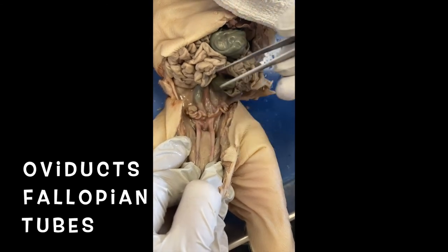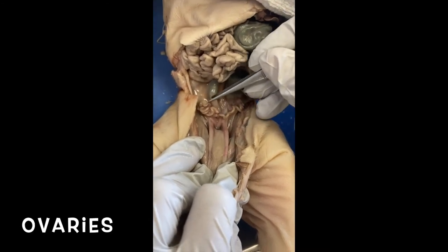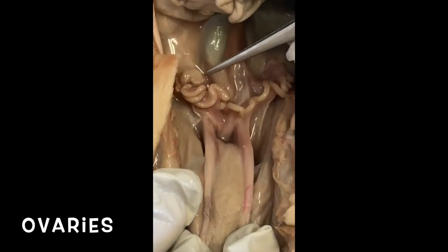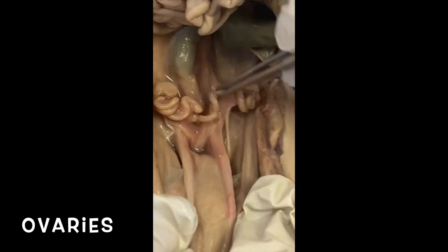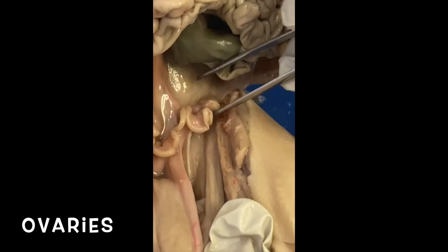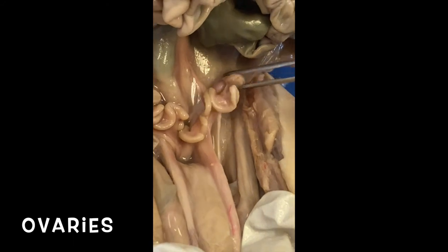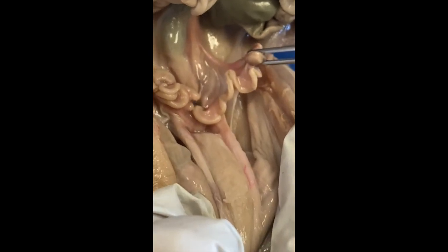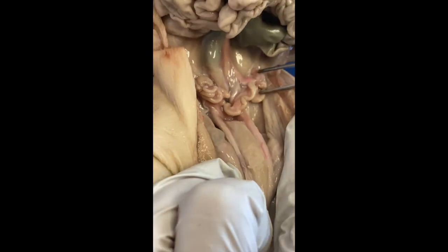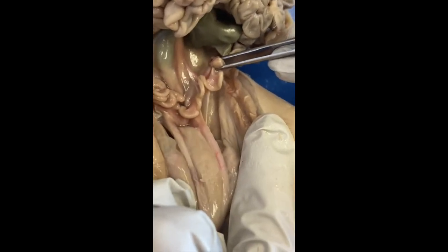And this is a gorgeous ovary here at the end. So what would become the ovary, there's one right there at the end. It looks like a little bean. Same thing on the other side, oviducts here, leading to the very end, which should be another ovary. I can get a hold of it. Yeah, I did. And there it is. Right there, it's kind of blending in. It's got connective tissue on it. There's the ovary on that one.